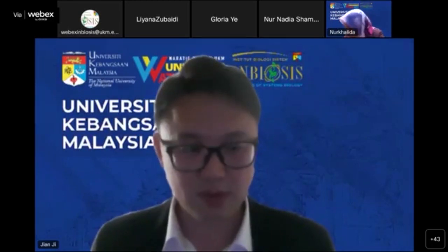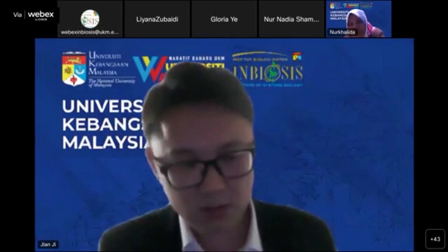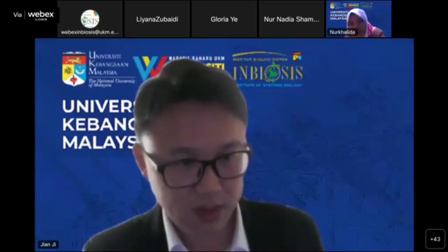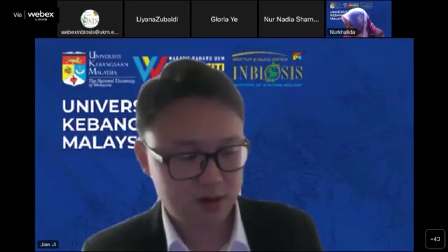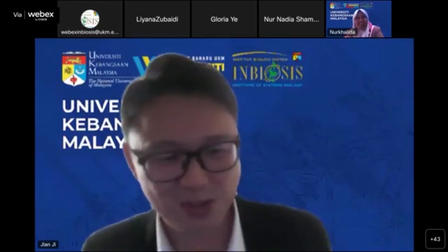So it was good. But for GC, I think there is no in silico database right now. Maybe the algorithm is not good, or not many people work on it, because not many people use GC these days, and most people choose to use LCMS.